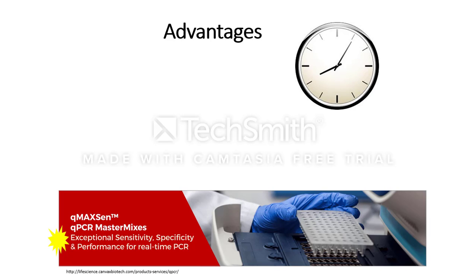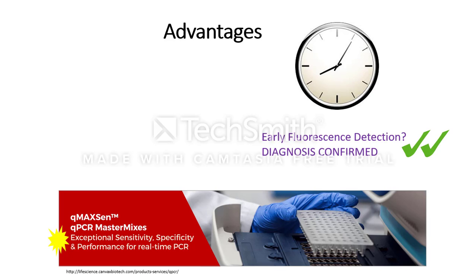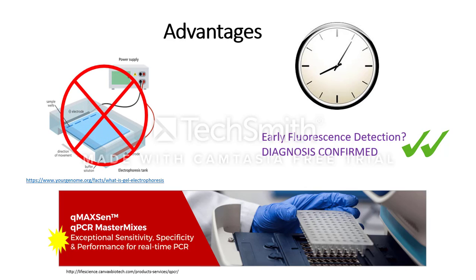There's no need to complete the full number of cycles if simply looking for gene presence once fluorescence detection is available. Thus, you are able to quickly confirm diagnosis. qPCR also allows you to collect data during the reaction process, so there's no need to run a gel after the endpoint is reached. Thus, you are able to instantly confirm presence or lack of presence of intended gene samples.